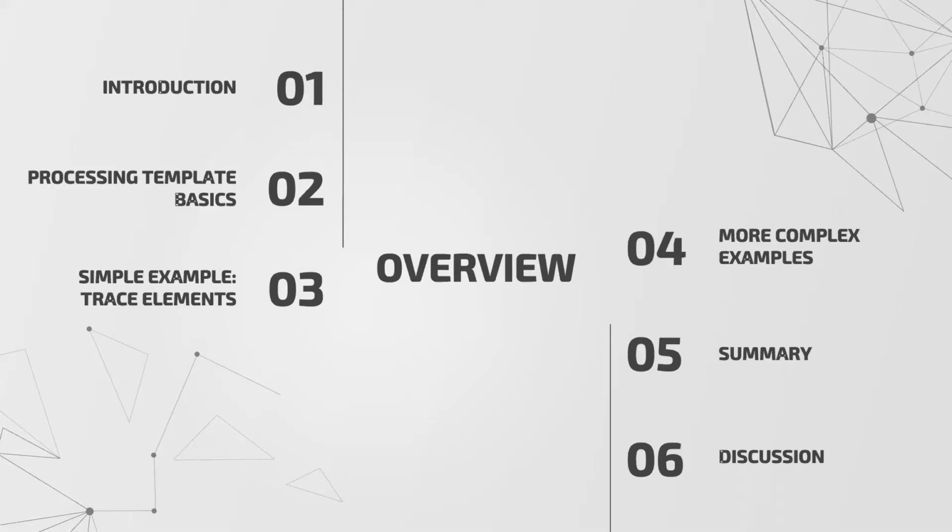And then once we've created an example template, we'll also look into some more advanced examples. We won't have as much time to cover them in detail because they are more complex, but more just to give you a feel for what is out there and what is available. And we'll finish up with a summary, and we'll have time for some questions and a discussion at the end.